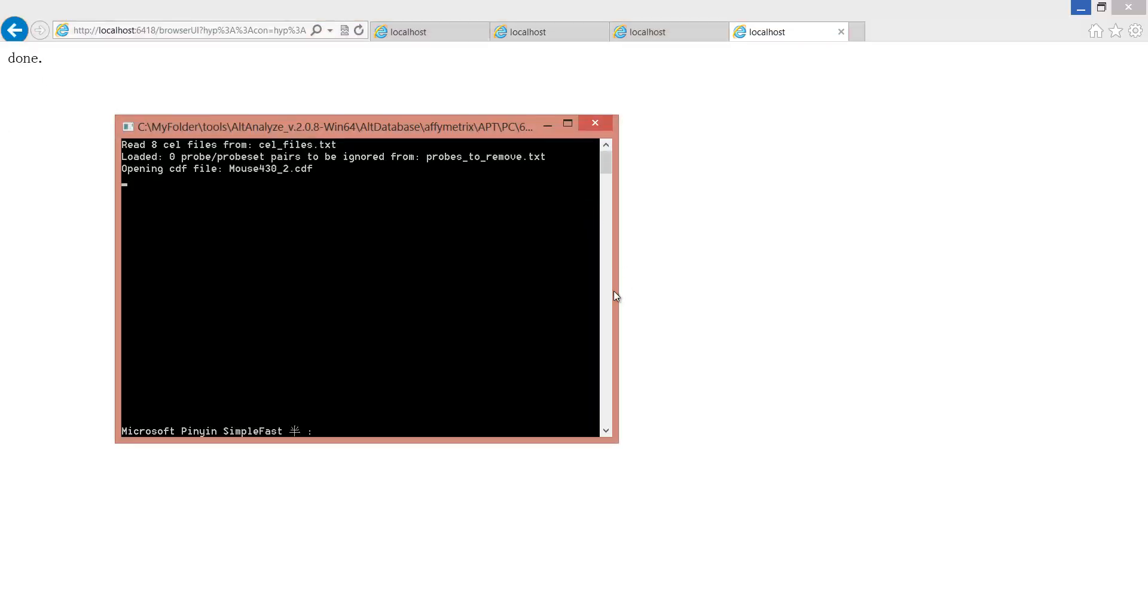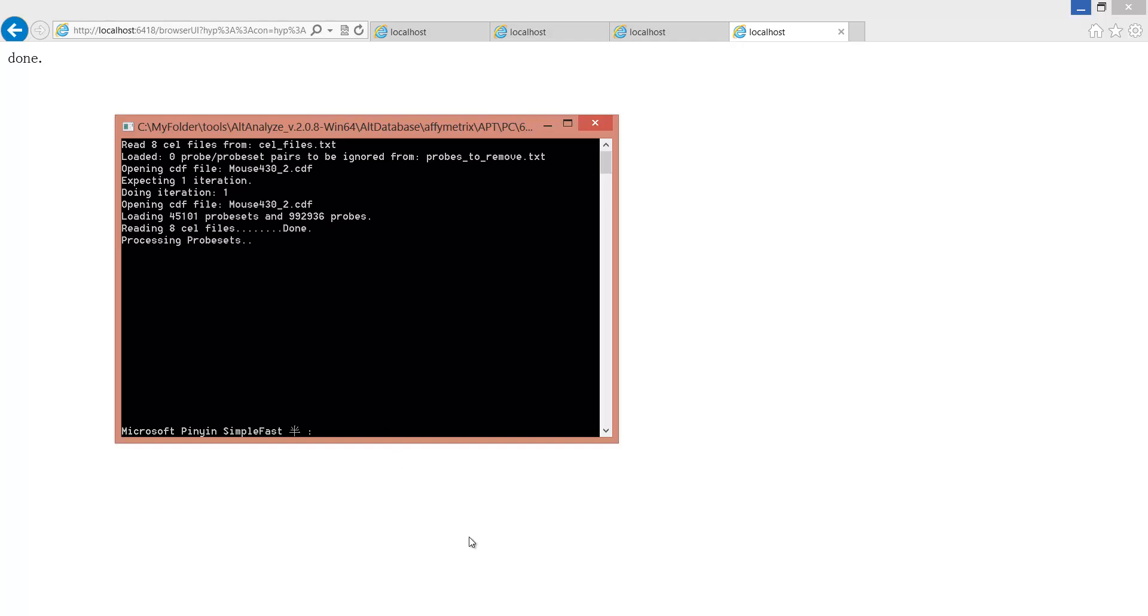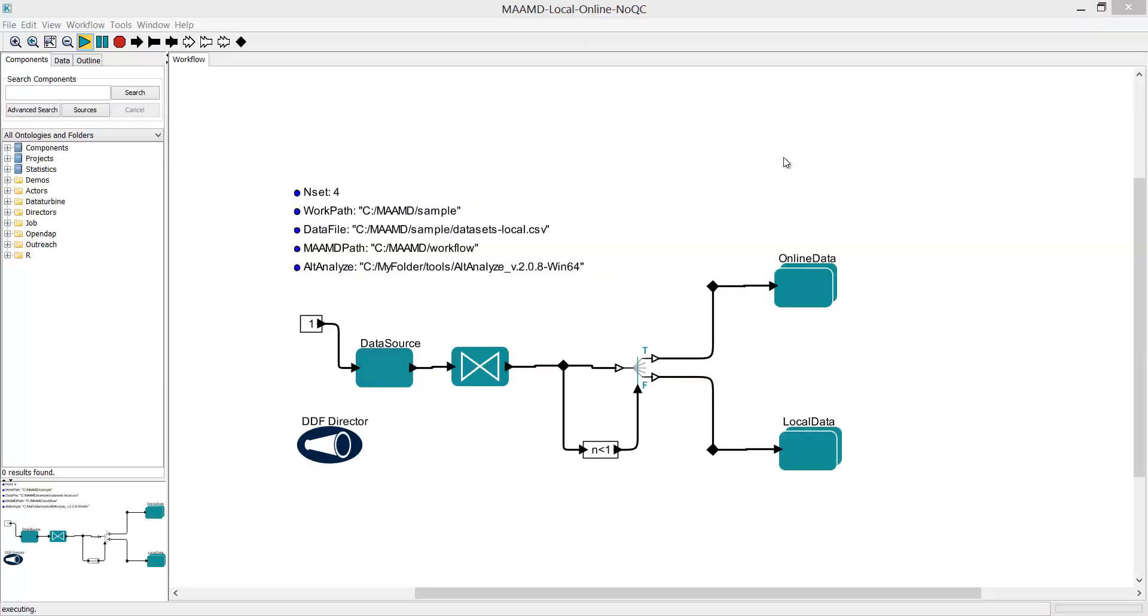Now Windows come to remind you that MAMD has started to analyze the first dataset.